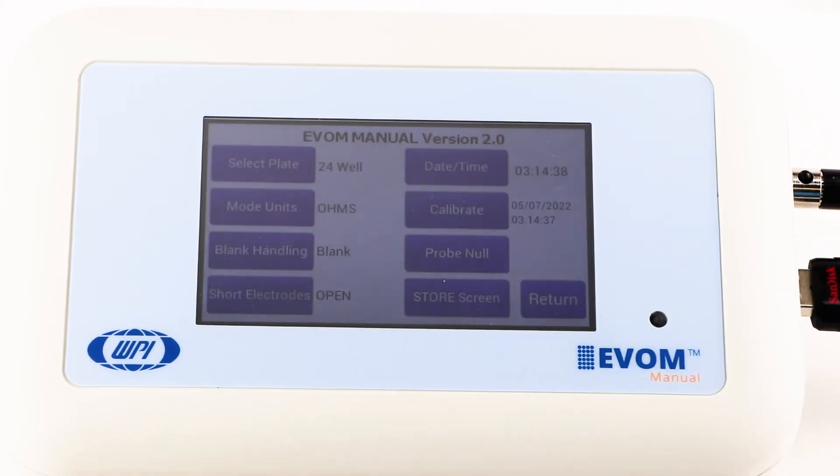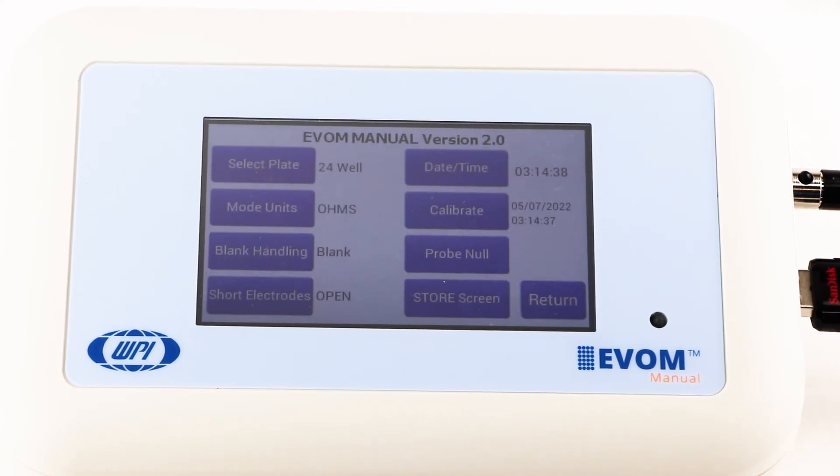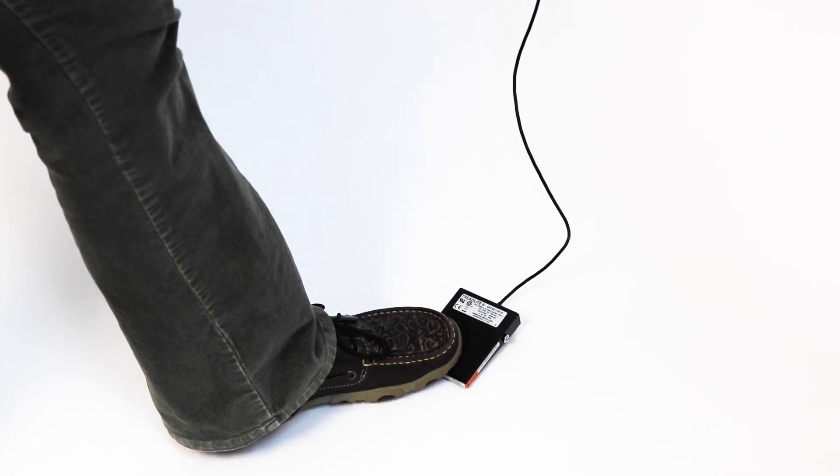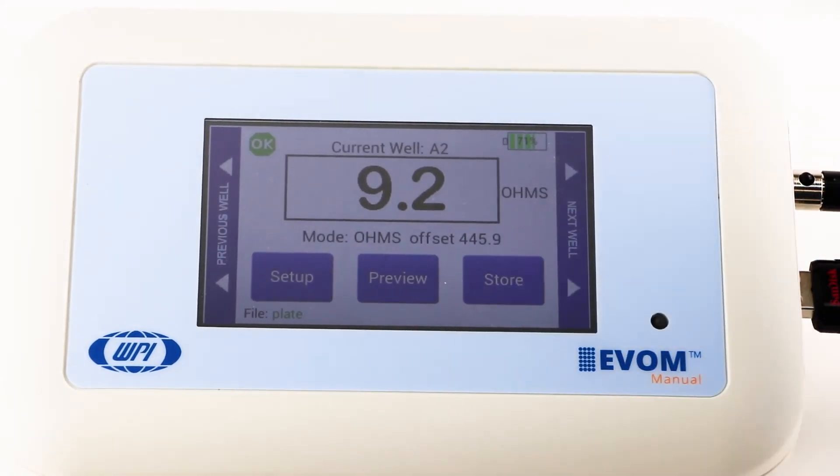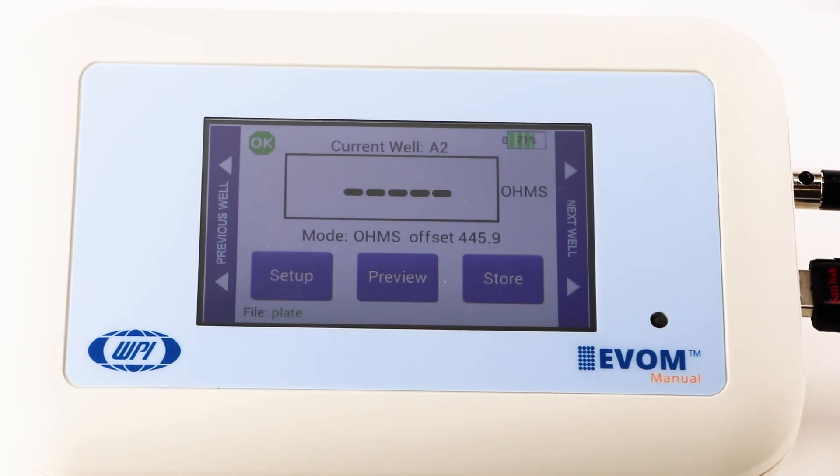Press return to navigate back to the main menu. Now you can begin measuring by pressing the foot switch, or simply touch the store button on the screen. Repeat the sampling process with each well.